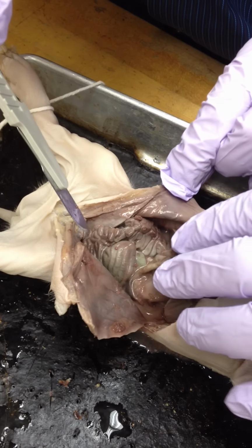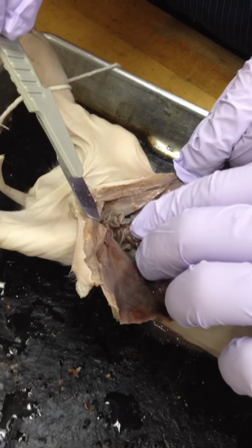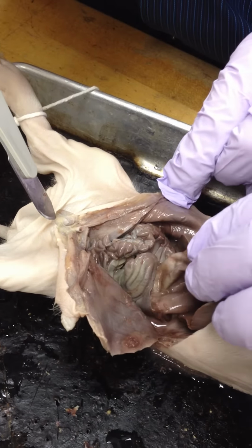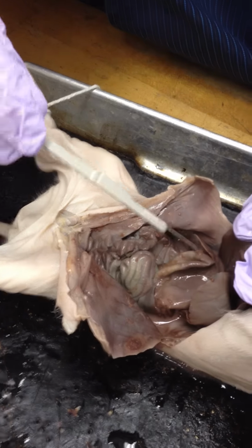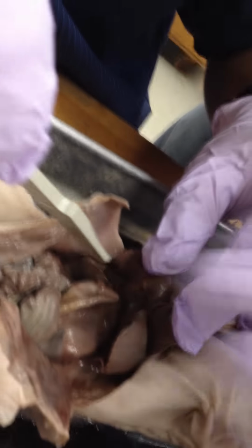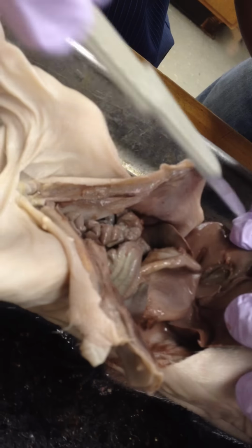Well, pigs have it kind of different as far as the transverse goes, but there's the small intestine. Can you see the gallbladder? Did you puncture the gallbladder? No, the gallbladder is fine. It's right up underneath, inside. There it is, right there, the green, squashed pea, right up underneath the liver.